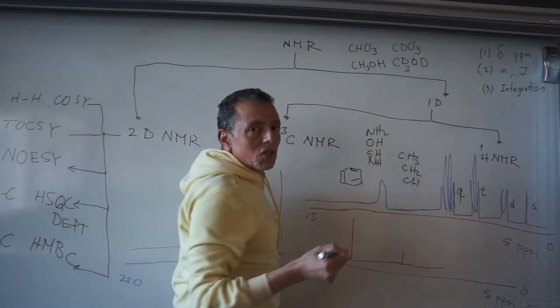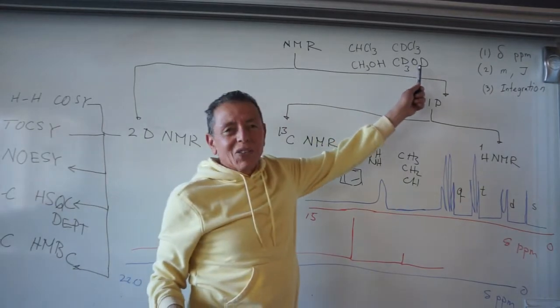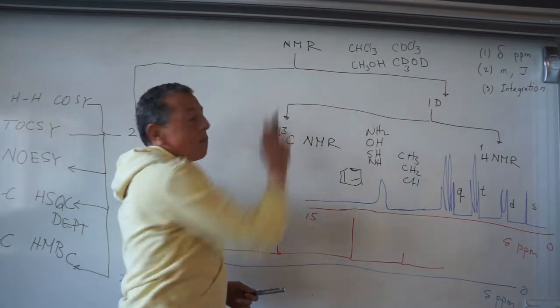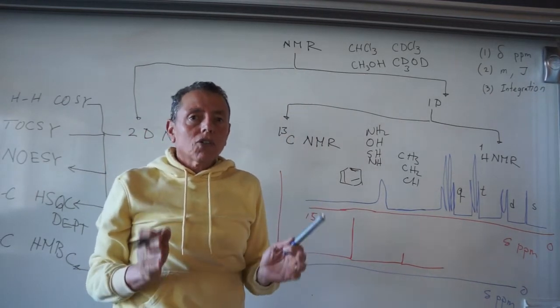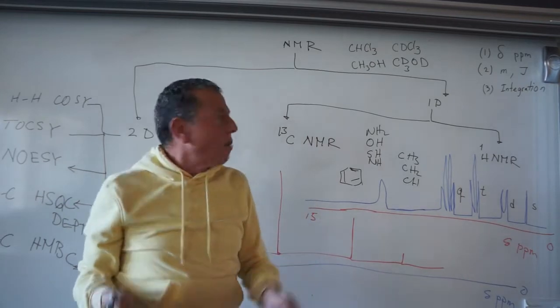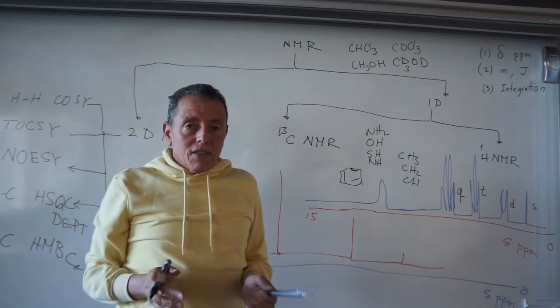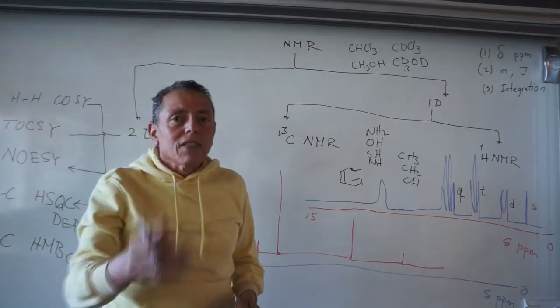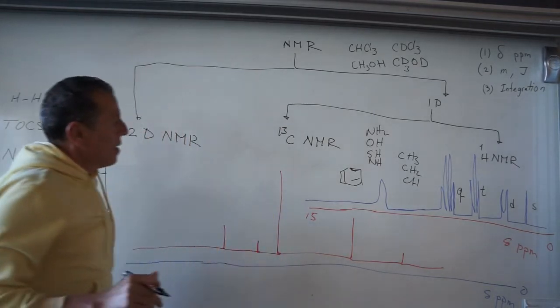That's why the solvents for NMR are extremely expensive, because you use deuterated solvent. Additionally, the machine itself is very expensive, because as I told you, it is the only tool for structure elucidation of novel compounds. Moreover, for maintenance of NMR, we have to keep the level of nitrogen and helium, and this costs money. So the running costs for NMR are very high.